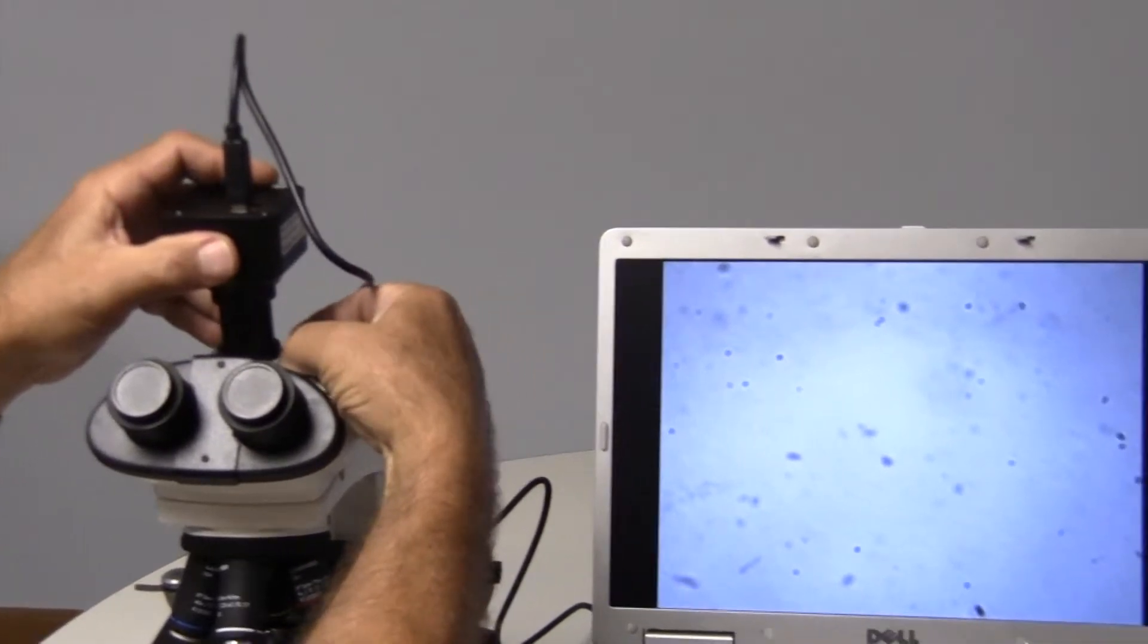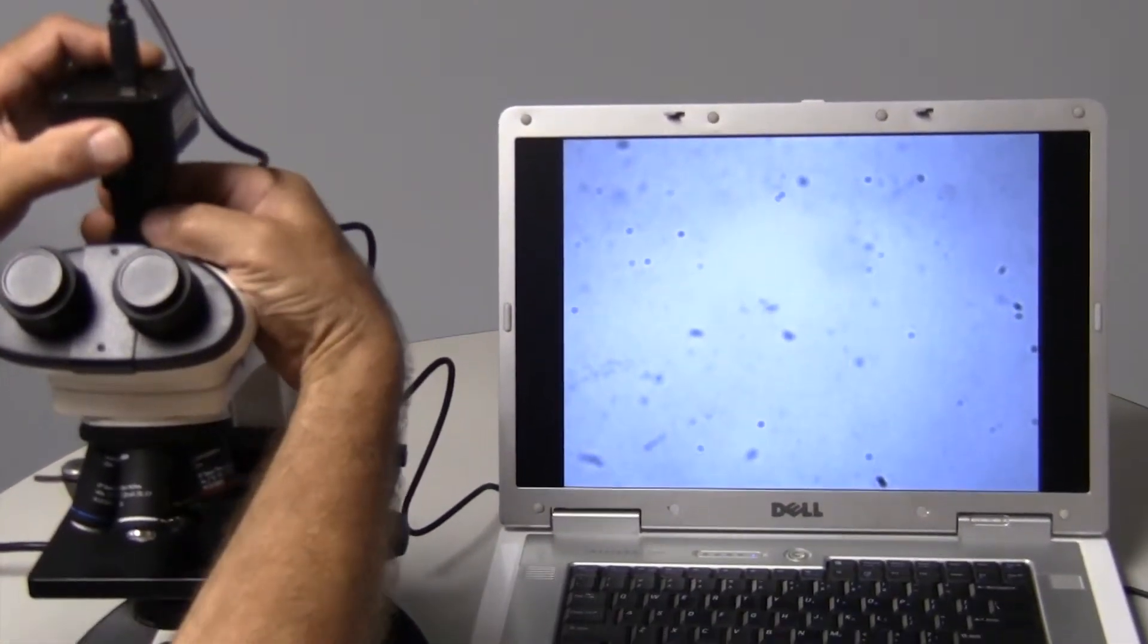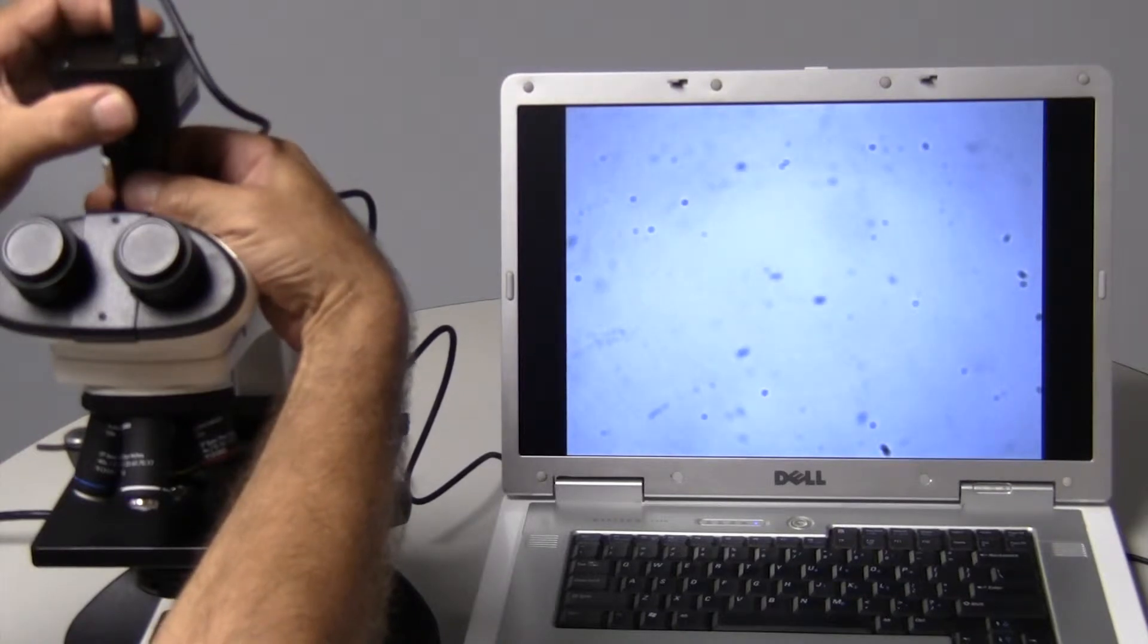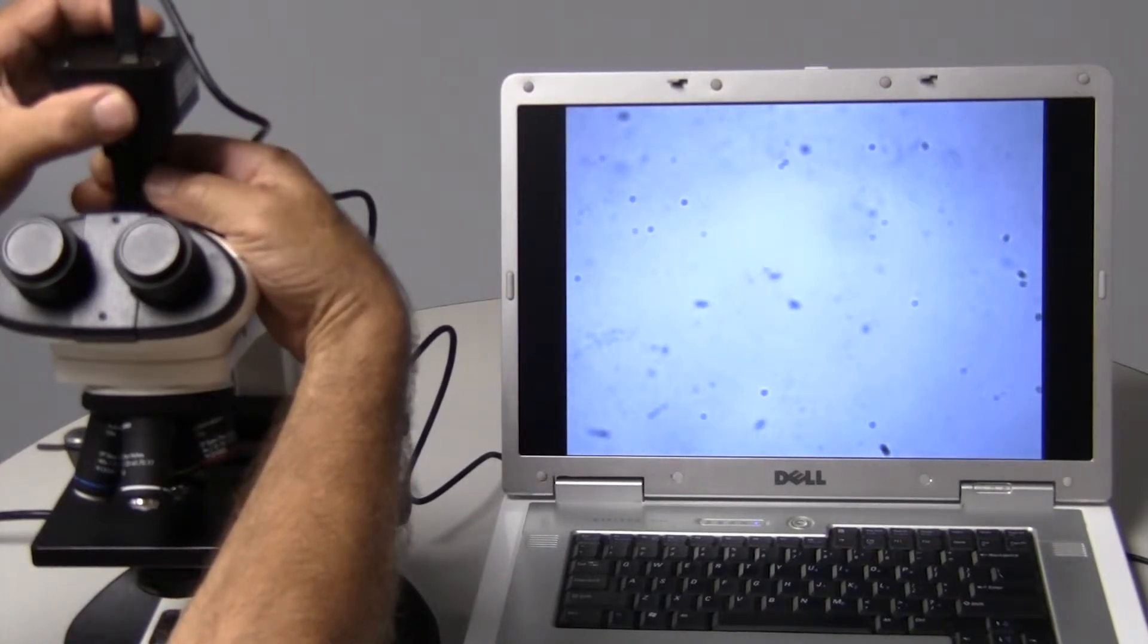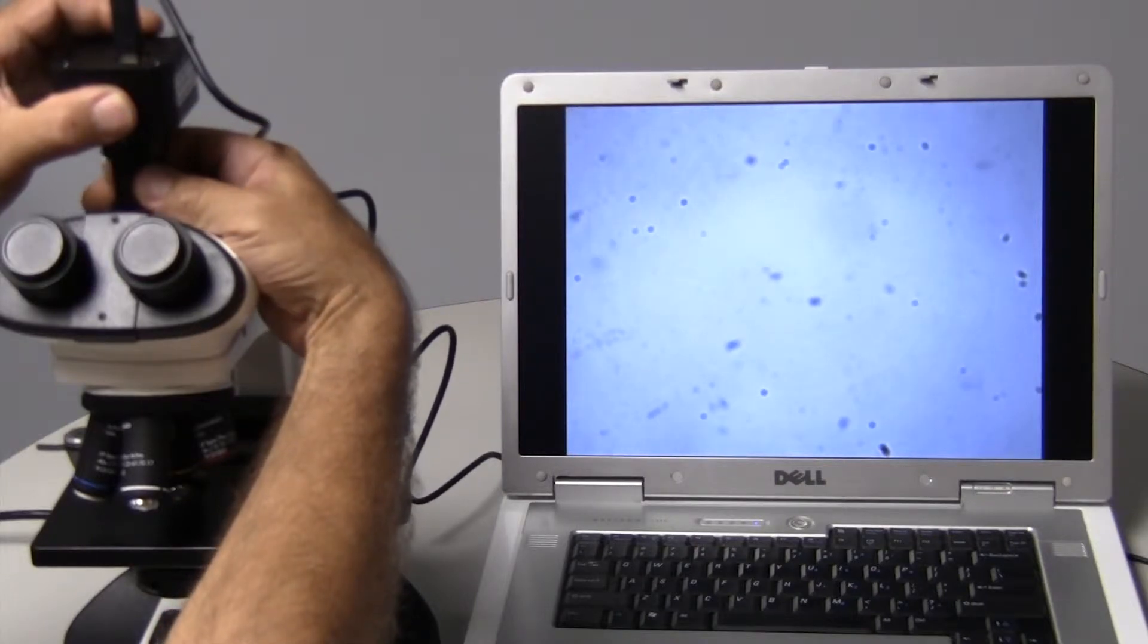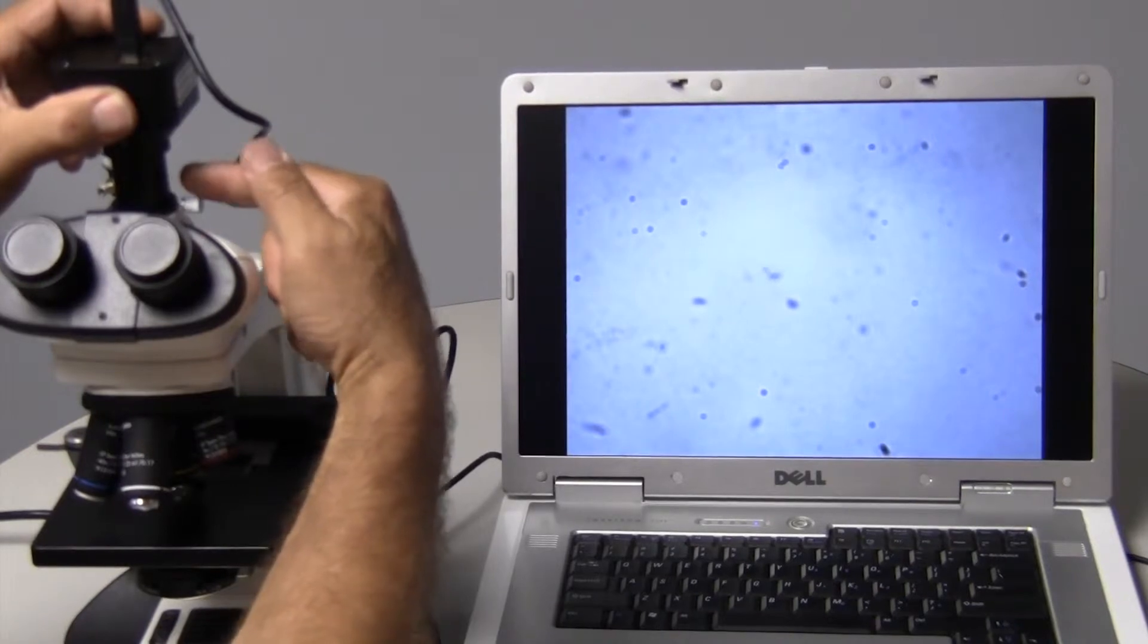So what I'm going to do now is, if you look at the dirt on the screen, I'm going to rotate just the intermediate lens. And when I do this, you'll notice that there is dirt that doesn't move in the field, and there's dirt that rotates. So the dirt that's rotating is the dirt that's contained within this lens.